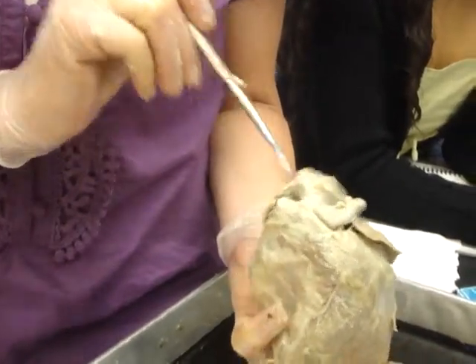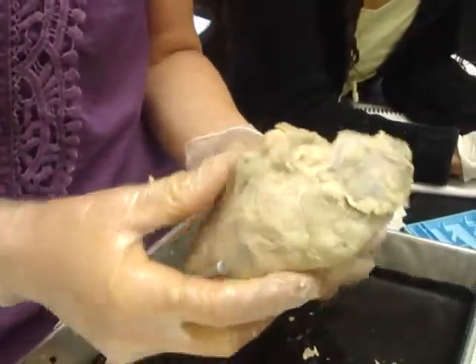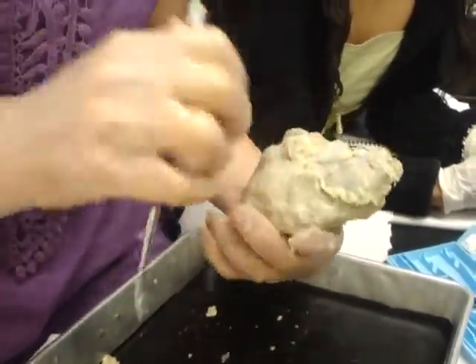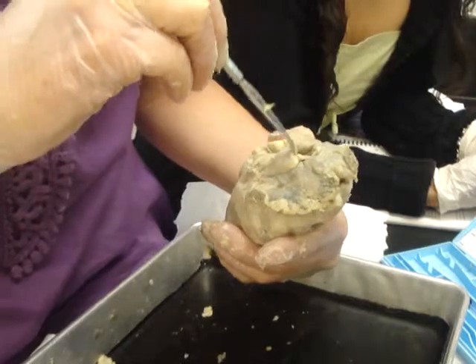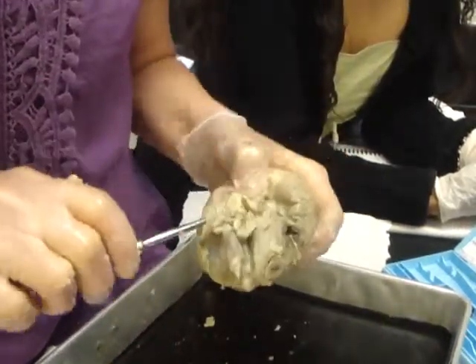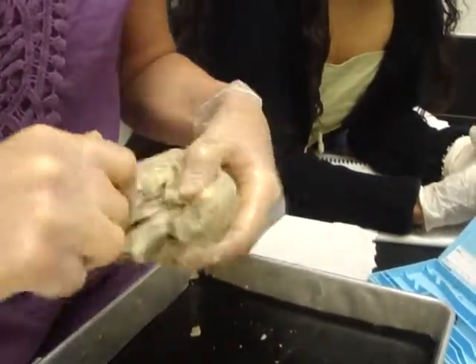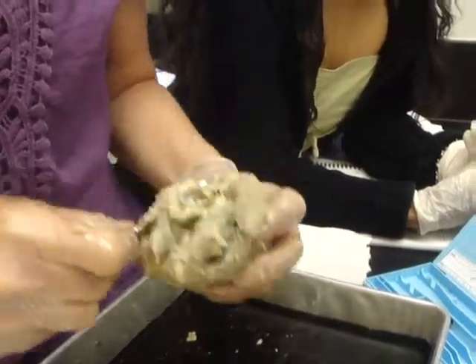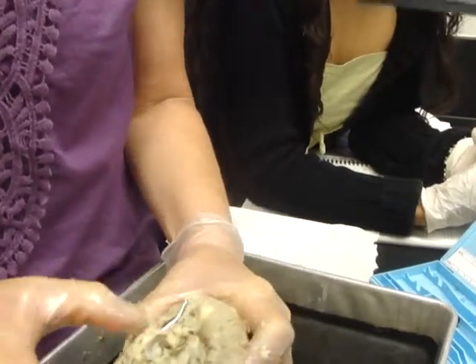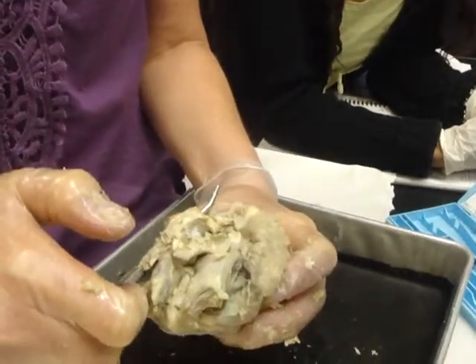If you turn it to the posterior side, you will be able to find — this is the superior vena cava, and this is the inferior vena cava.